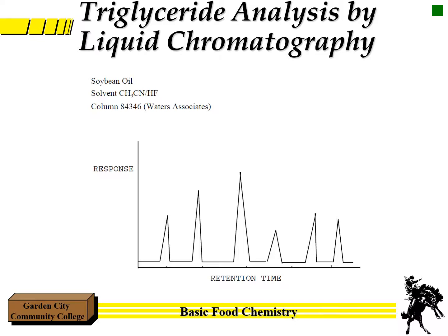And that can also be done with triglyceride analysis with liquid chromatography. This would be an example of what it looks like with soybean oil, using a specific solvent and what the column actually is in terms of its number.